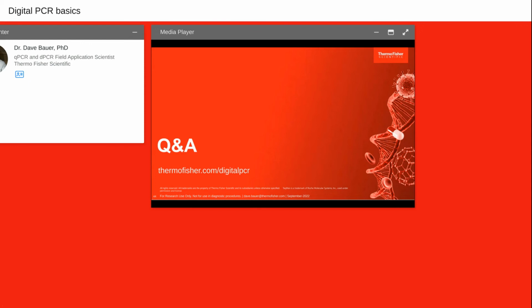Your first question is, you mentioned that the absolute Q can support up to 4 targets per reaction. Developing a successful 3 or 4-plex real-time PCR assay can be tricky. How does digital PCR compare to real-time PCR for multiplexing?